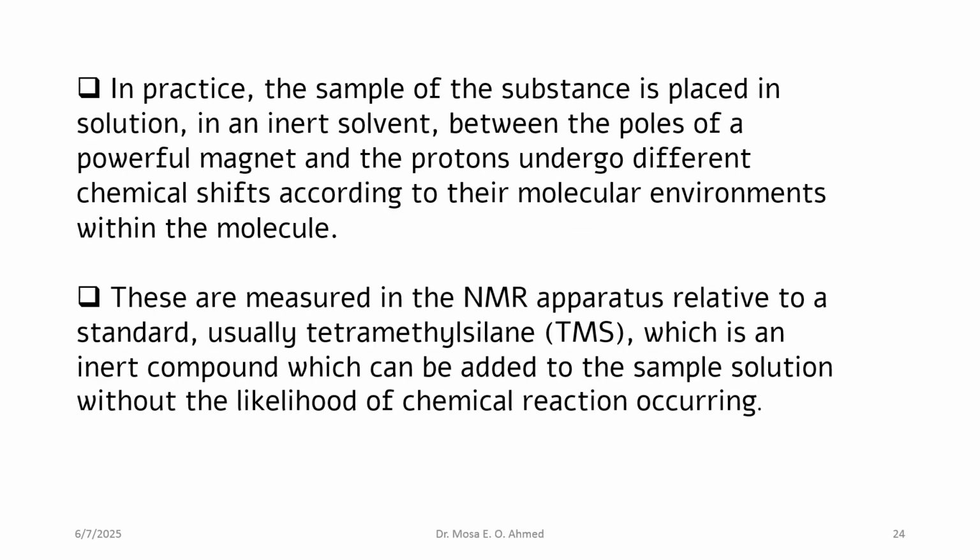The measurement in NMR apparatus, the measurement of chemical shift, is always relative to a standard, which is usually tetramethylsilane, or TMS for short, which is an inert compound that can be added to the sample solution without the likelihood of chemical reaction occurring, because these inert compounds have no interaction with the radio frequency waves.